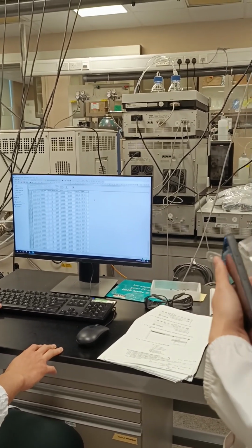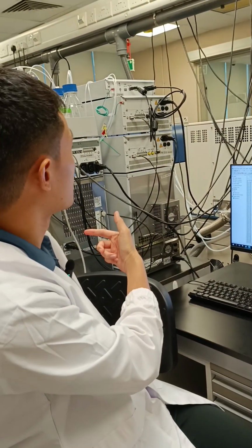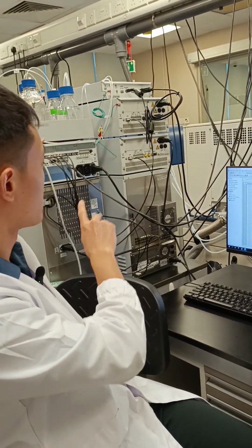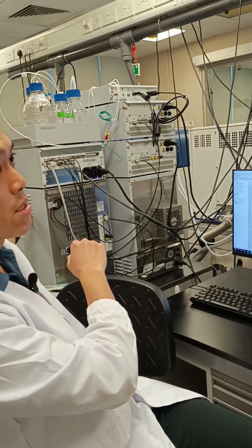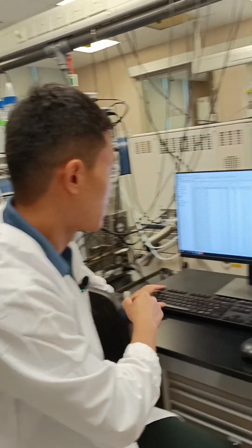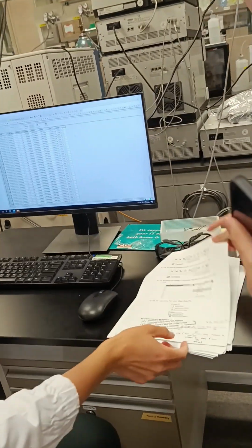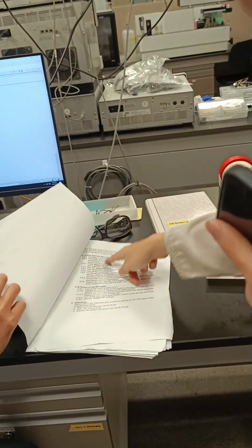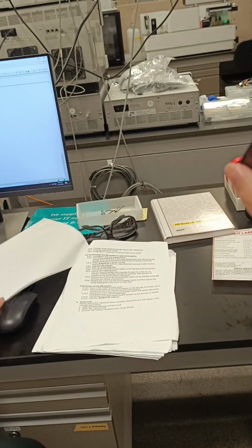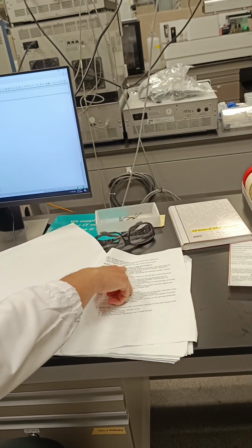After you're done with flushing the column, you just take it out, then you flush the system. So always remember, flush the column first, then you flush the system. Then after you flush the system, just leave it. That's all. Purge the LC system for 10 minutes.